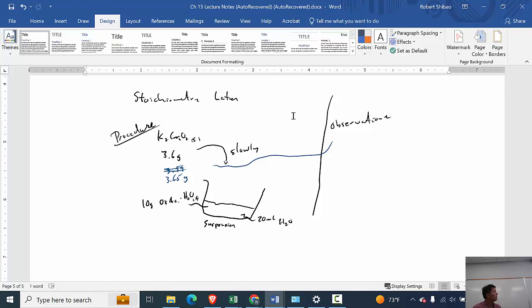So the way I'd like to have this is the lab notebook page. All right. What do we reserve the first 2 pages for? Table of contents. So leave those blank. So reserve first 2 pages for table of contents. I'll call it TOC. So this experiment's going to start on the third page. For the third page, you can outline the reactions that we're doing.